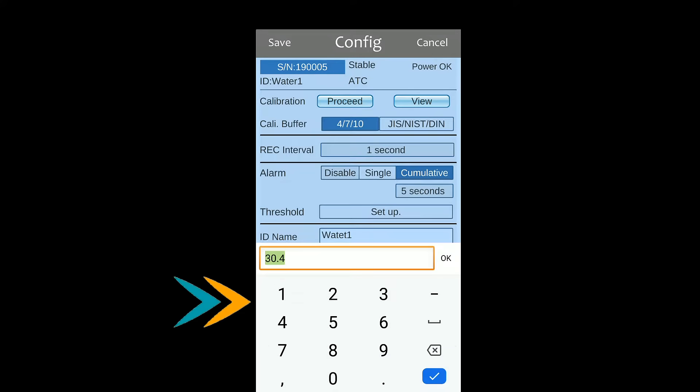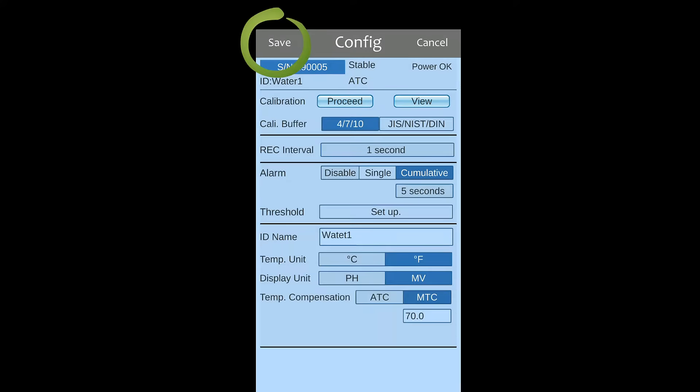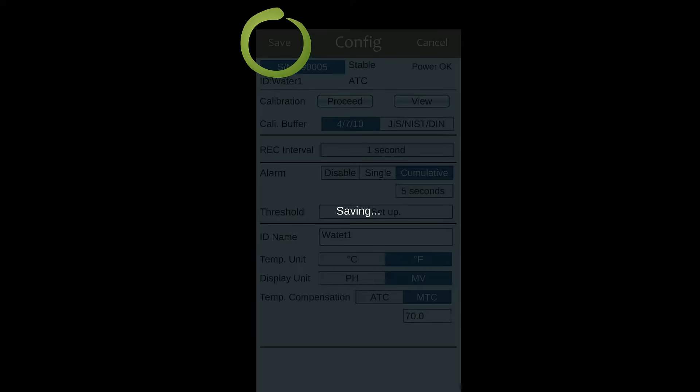Enter the compensation value of temperature while choosing manual temperature compensation. Always remember to press save button to synchronize the setting.